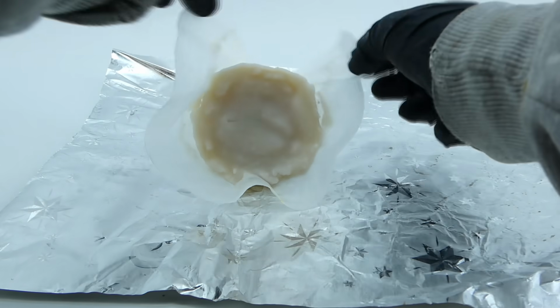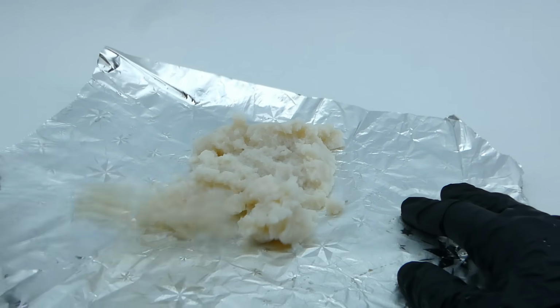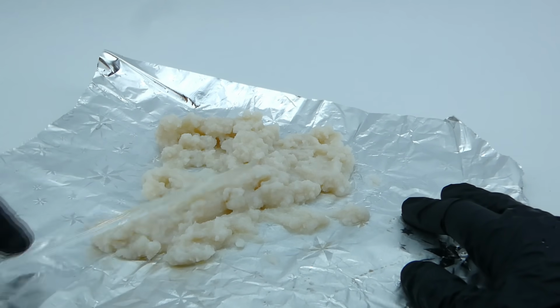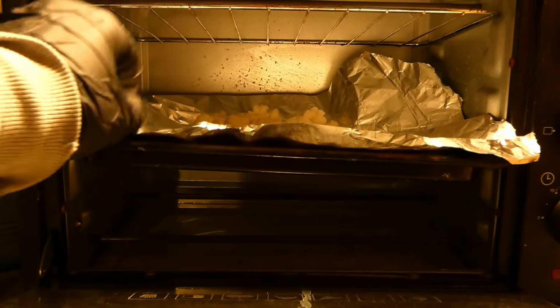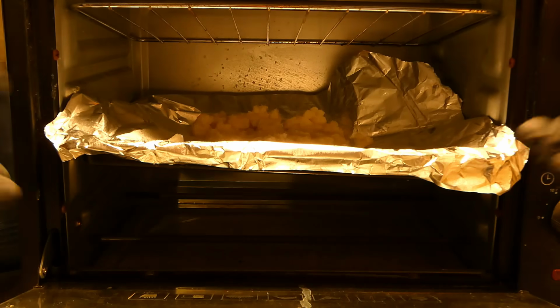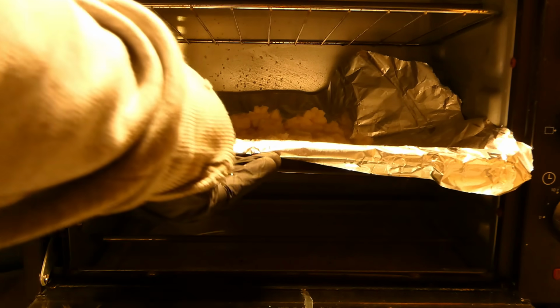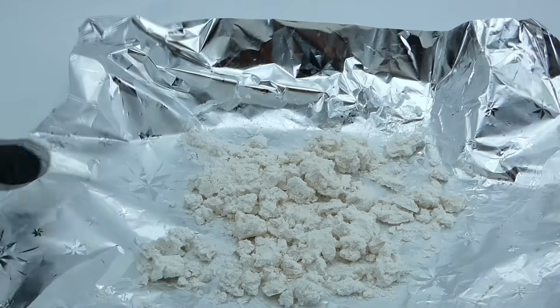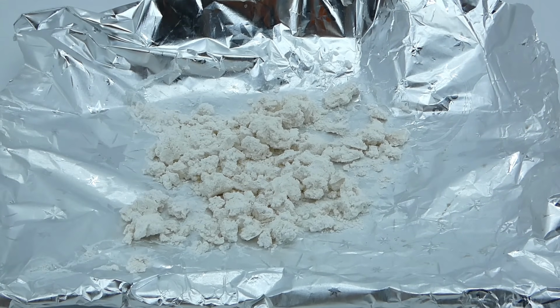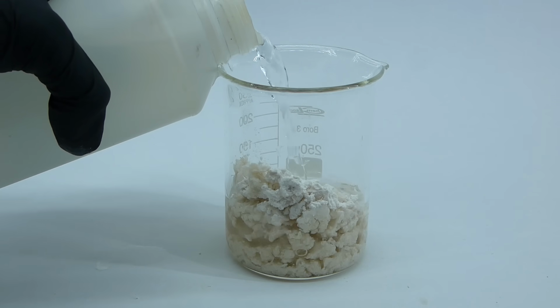I now had to dry it to convert the silicic acid back into silicon dioxide, and to do that, I got it onto a sheet of aluminum foil and put it into the oven for a few hours. The high heat turns the silicic acid into silicon dioxide, which turns into a white clumpy powder. I then have to wash this powder with water to remove any residual contaminants and dry it again.